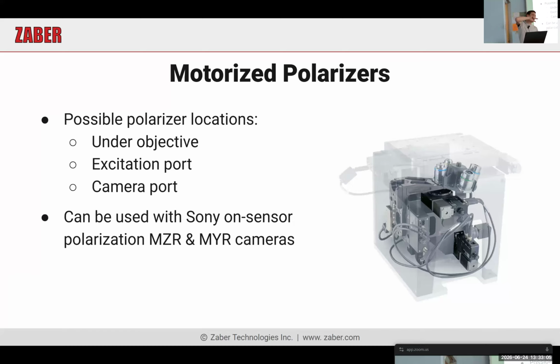But then at every individual point in a single shot, you can get all of the polarization data across your entire frame.